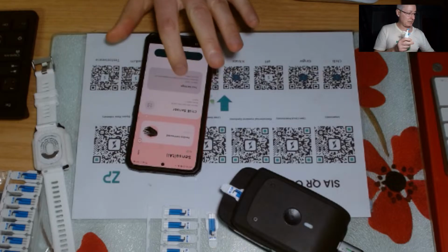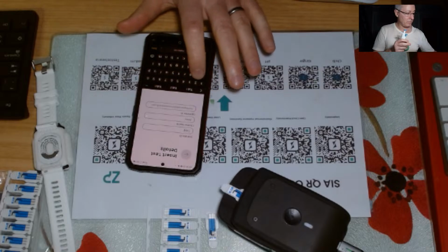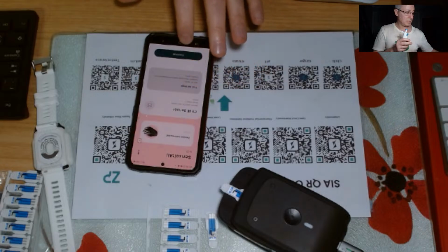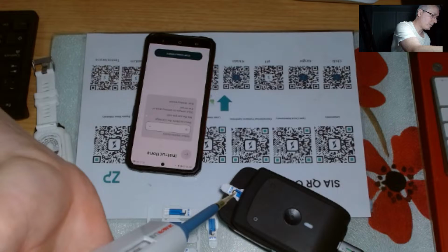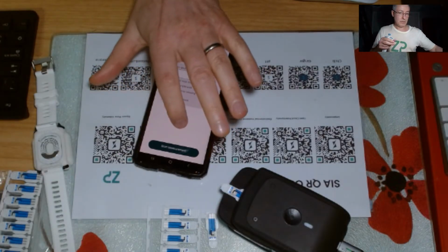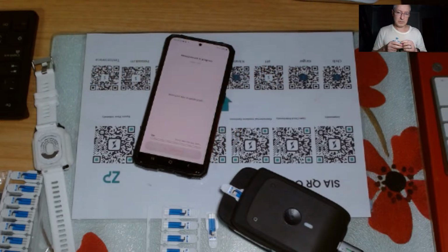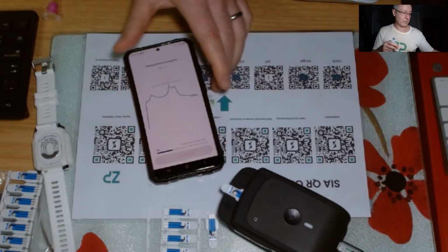But let me do a demonstration of this. I'm just going to give this a quick name. I'm just going to call that 42, tab 42. I'm just going to go to continue. I'll hit start in a minute. So let me just get the sample first of all. I'll put the sample on there. And I will hit start instrument. I realize that's now upside down for you. No, actually that's the way it ran for you.